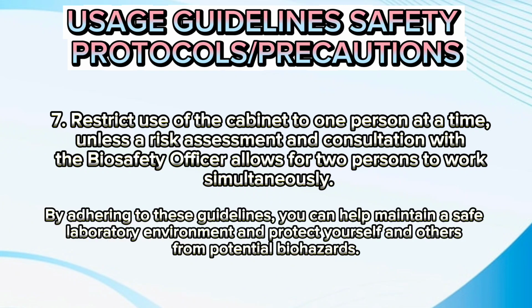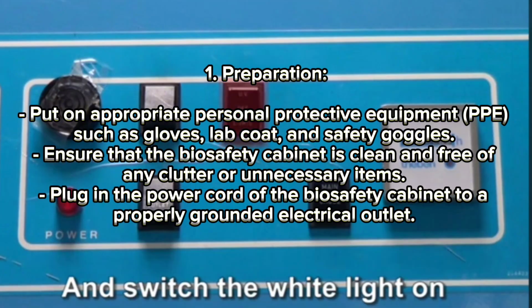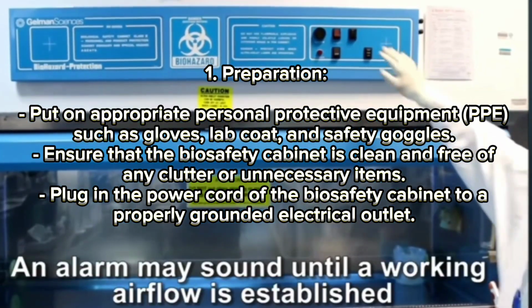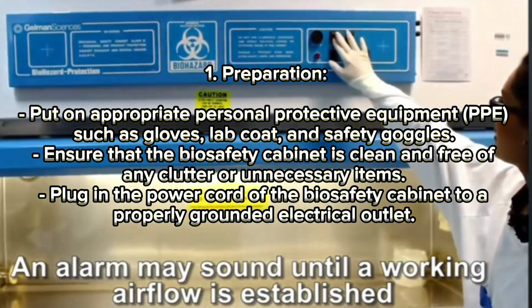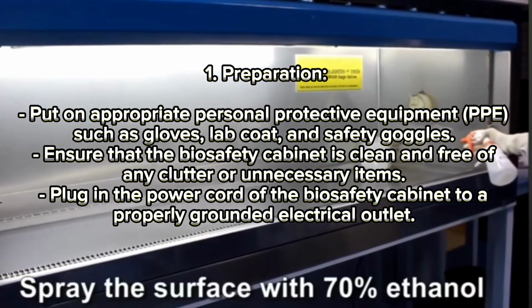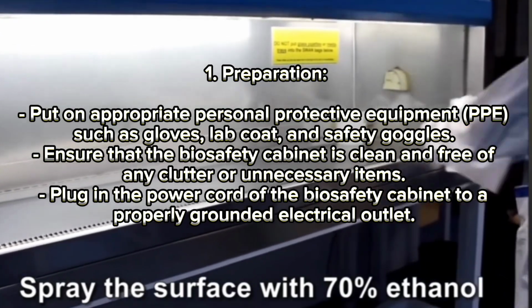By adhering to these guidelines, you can help maintain a safe laboratory environment and protect yourself and others from potential biohazards. We're going to tackle the step-by-step on how to operate the biosafety cabinet. First is preparation. Put on the appropriate personal protective equipment such as gloves, lab coat, and safety goggles. Ensure that the biosafety cabinet is clean and free of any clutter or unnecessary items.